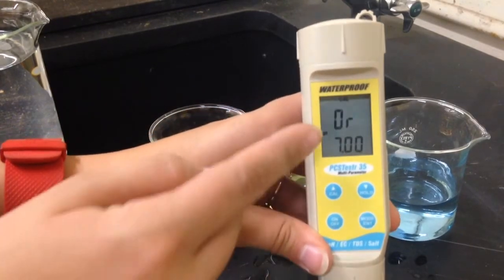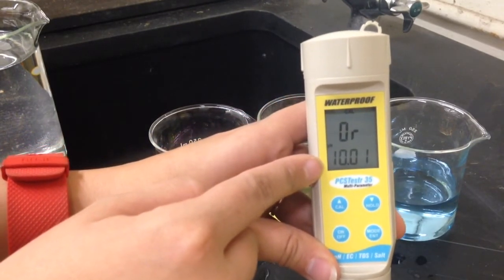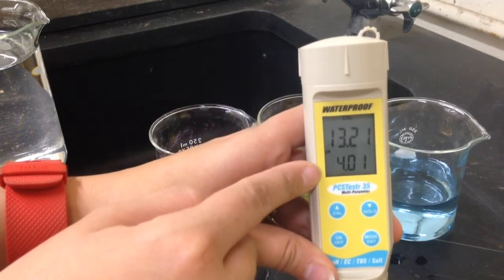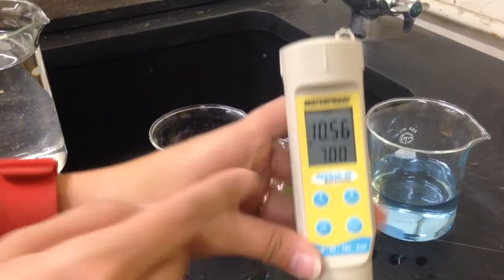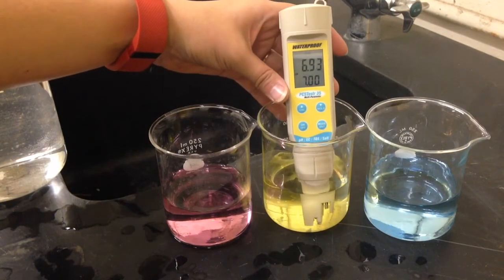You can see that the bottom display, or the secondary display, is flashing the pH values of each of the pH standard solutions. We are going to begin by immersing our meter in the neutral solution with the pH of 7.